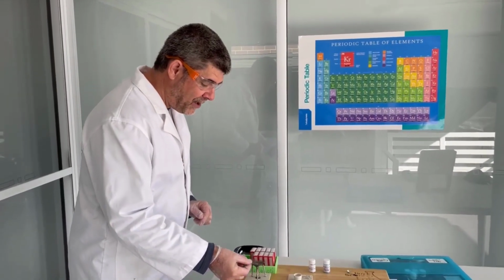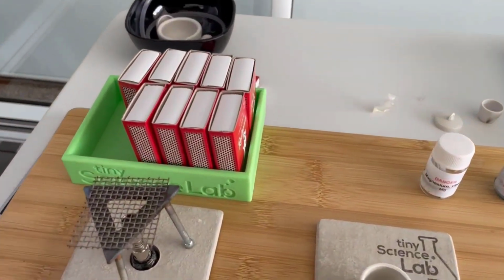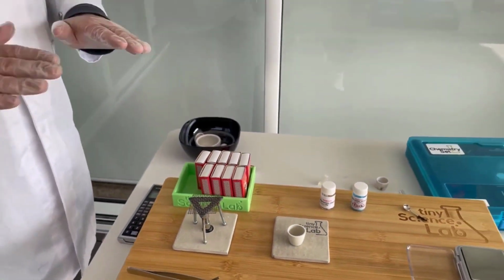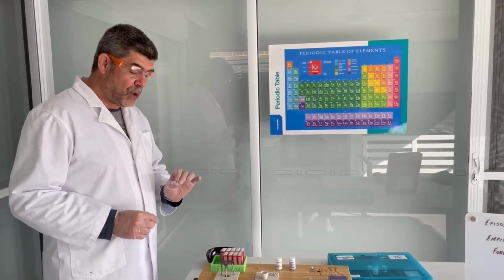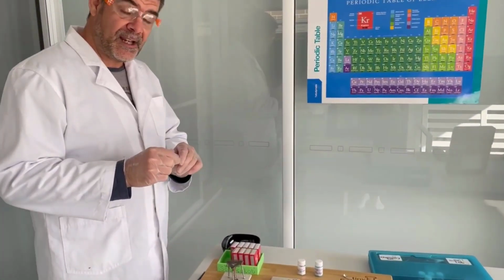This time I am going to use a gauze mat as well, just to help spread the heat out. Now obviously gauze mats are much better for glassware because they help spread the heat out more evenly, and I do want more direct heat. But my little Bunsen burner is generating a lot of heat. It's working really well, so I think we'll still be okay. So let's repeat these steps again.